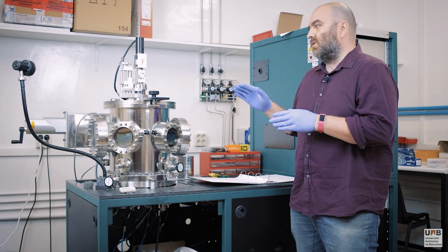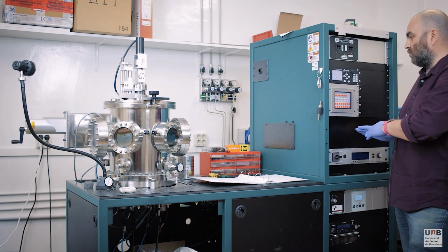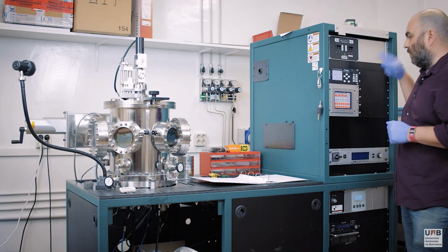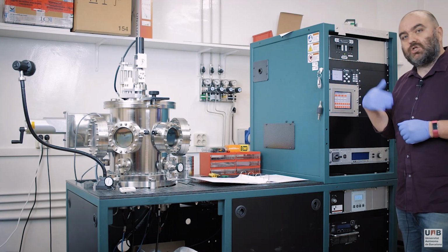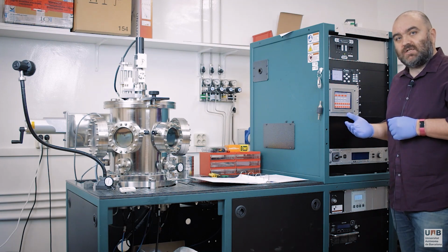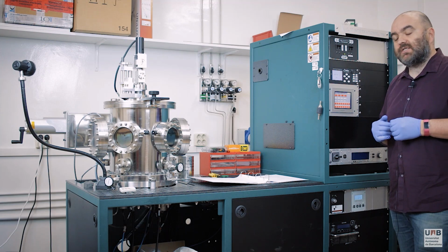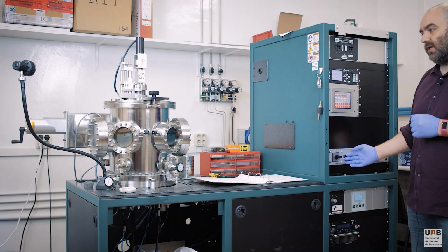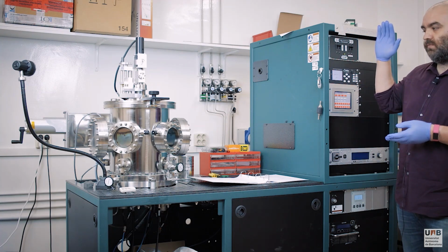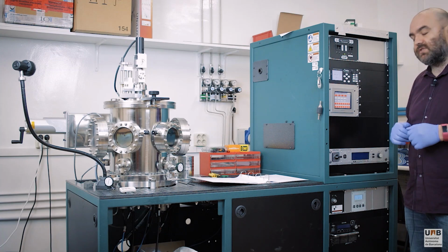The environment in the chamber is controlled by these power banks here and these controls. The most important one is the mass flow controllers, which feed argon into the chamber, as well as other gases if you want to add things like oxygen or nitrogen to reactive sputter different kinds of oxide films. And then the power supplies, which actually supply the voltage to the gun and the substrate, which then drives the ions to hit the surface.